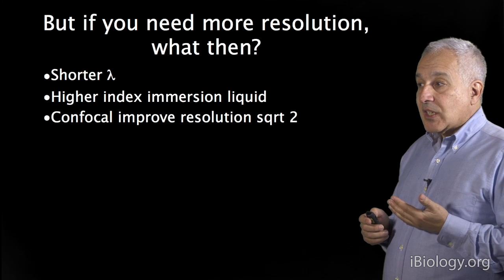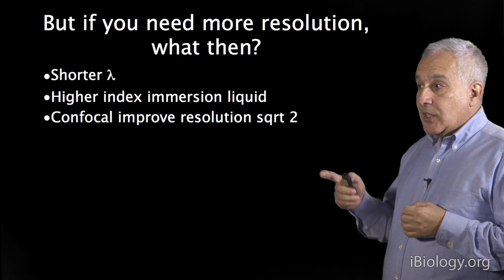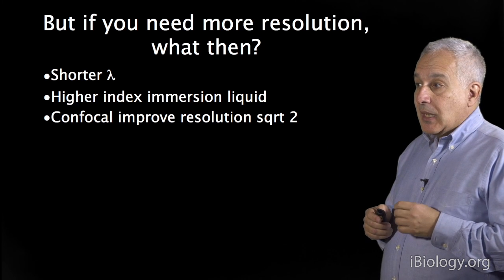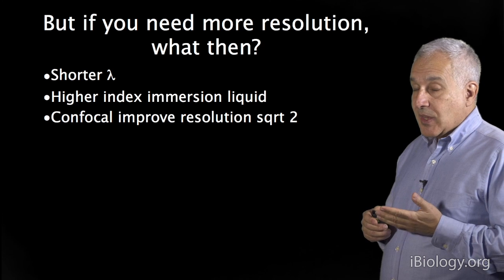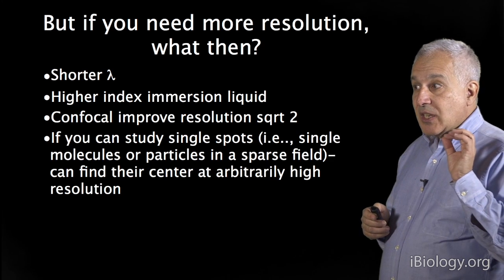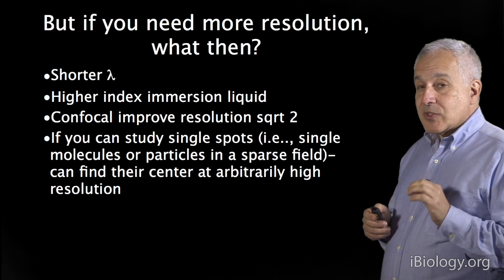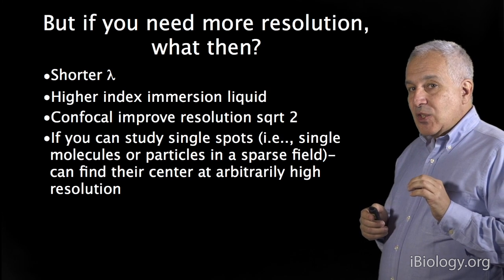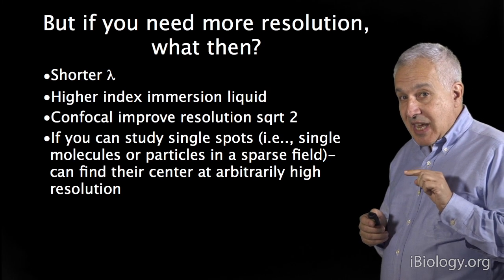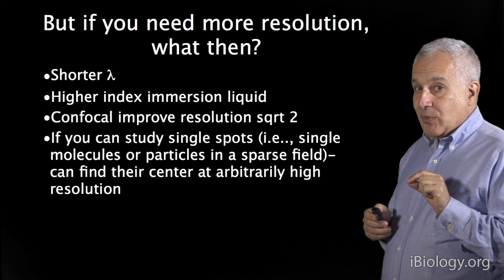As I've already mentioned, with the confocal, if you stop that pinhole down to the size of an Airy disk or smaller, you get an increase of about the square root of 2, 0.4, improvement in resolution, so that always can be used. If you are studying just single spots of light, single molecules, in fact, then you can know their position in space to much greater resolution, because the center of the spot is a very accurate rendering of where that object is.